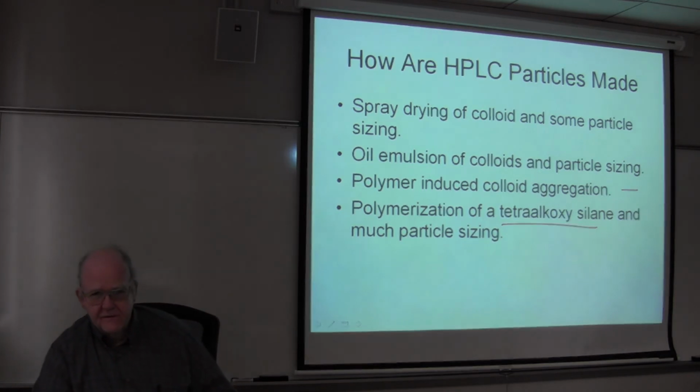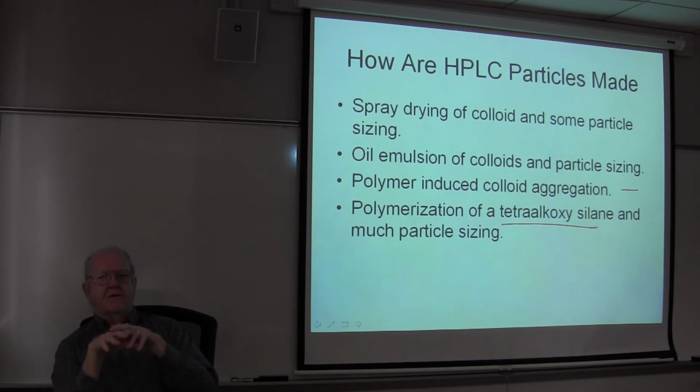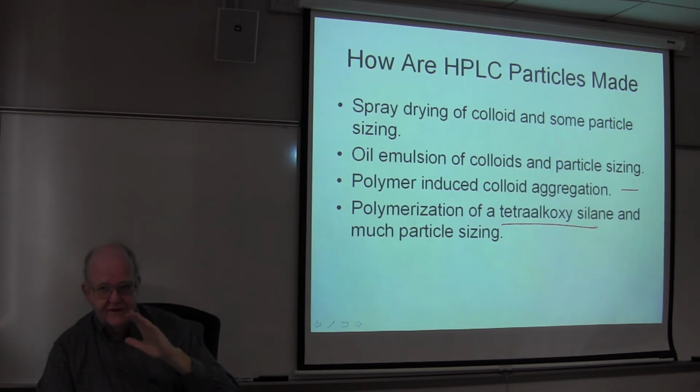Yes? If the polymer-induced colloid aggregation makes such well monodispersed particles, why isn't it used more often? Is it because it's so complex? The yield is terrible. You may only get 5 or 10% of all of the colloid that you put in forming these particles, number one. Number two, you don't know the details, and you actually have to wind up burning out the polymer. And some of the particles, if you don't do it just right, fall apart. So it's a tricky, touchy process.